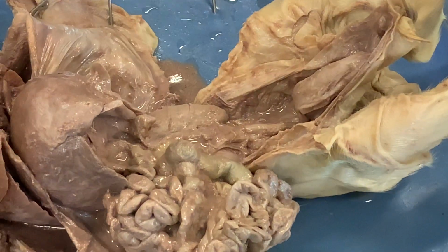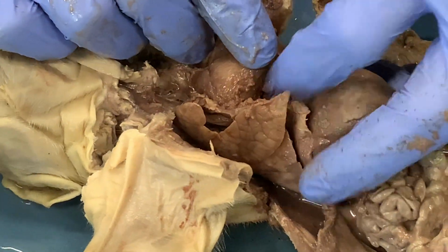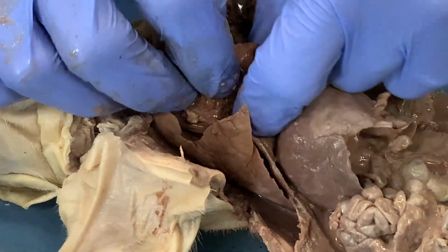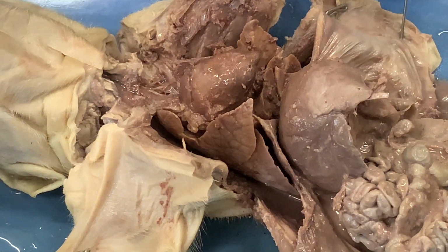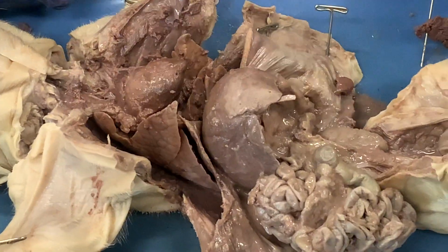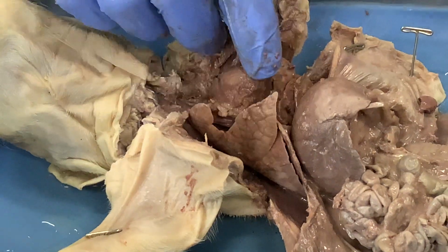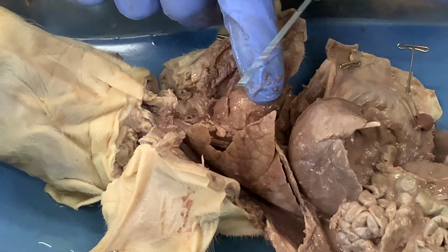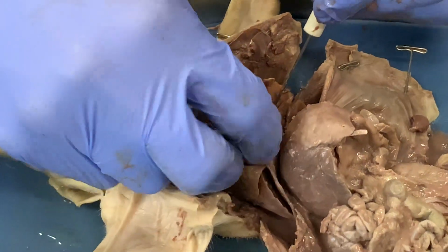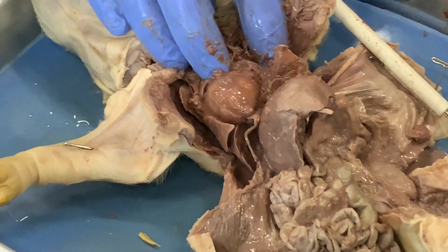Now we'll go back to the front of the thoracic cavity and look a little bit more closely at the anatomy of a heart. This one we will attempt to clean up, but you see there's a lot of this dark material inside of the abdominal cavity and the thoracic cavity. That is blood. So this piglet, when it was fixed, its blood coagulated and stayed in the body and didn't drain. So it may be a little bit difficult to see what's going on inside this heart, but we have a backup if this one does not look good.